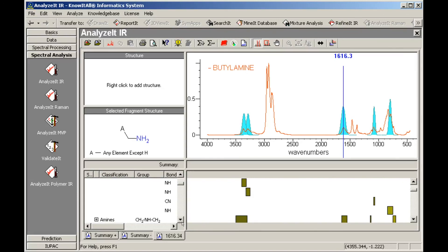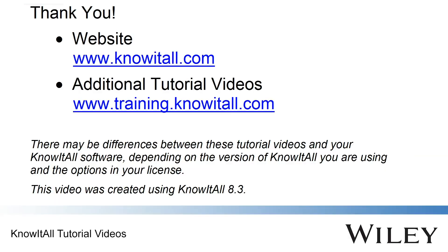This concludes the demonstration of how to create and use user knowledge bases in the Know-It-All Analyze-It applications.